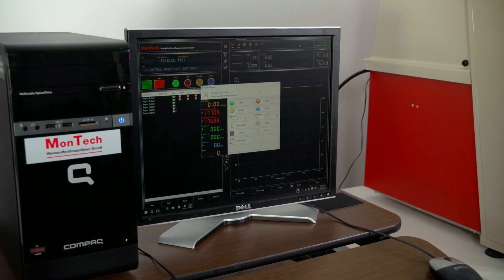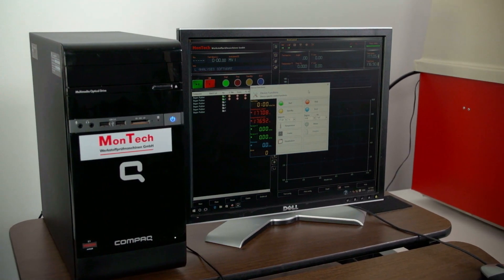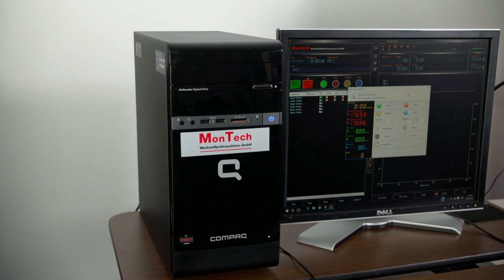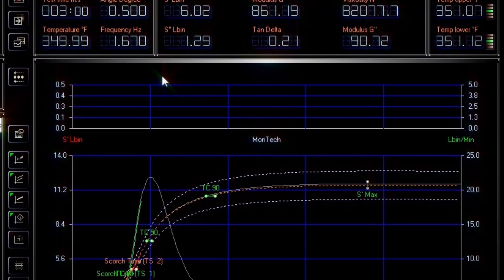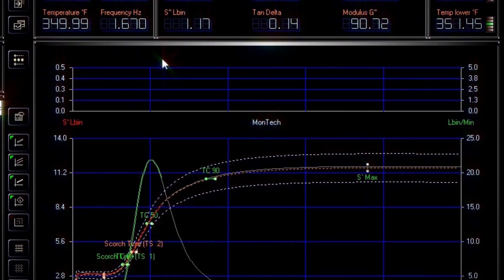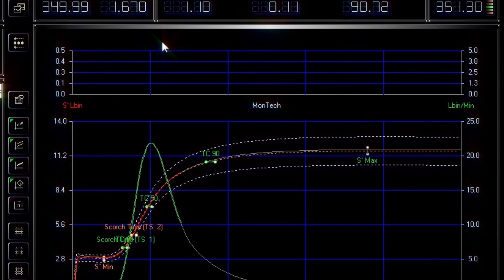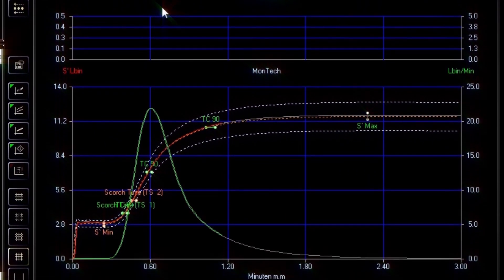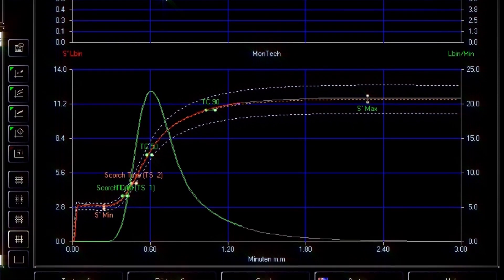MonTech upgrades include new Windows 10 PC and MonControl software for data acquisition and analysis. MonControl is designed to meet modern testing needs and comes with a large variety of test methods that can be easily selected from a preloaded list, allowing new operators to start testing within minutes.